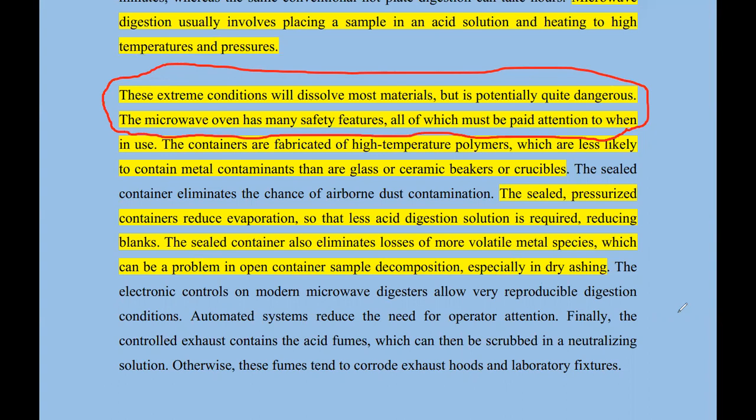And on that note, if you are boiling, let me say, water which contains salt, as the amount of water reduces, you are likely to experience some salts jumping off the heating vessel. So it's also important to put all those things into consideration to avoid or minimize the loss of the sample.